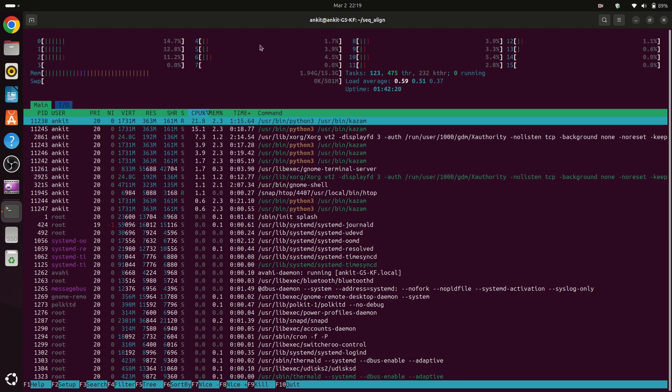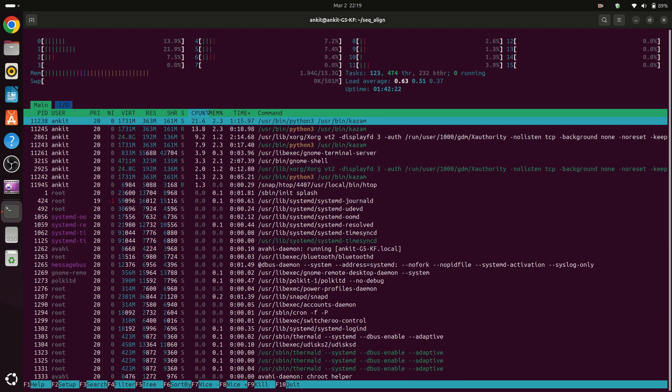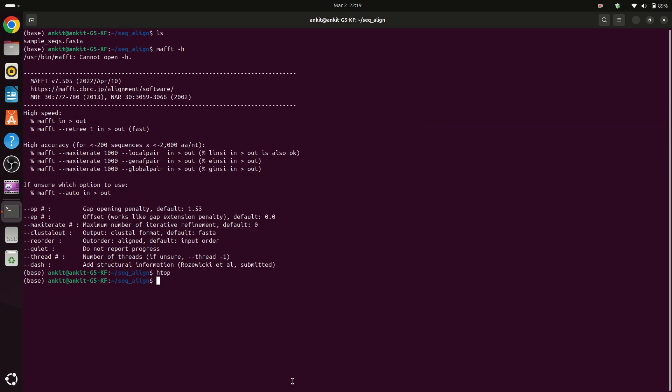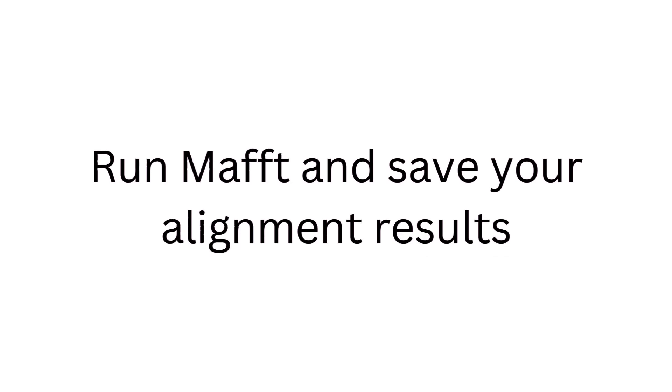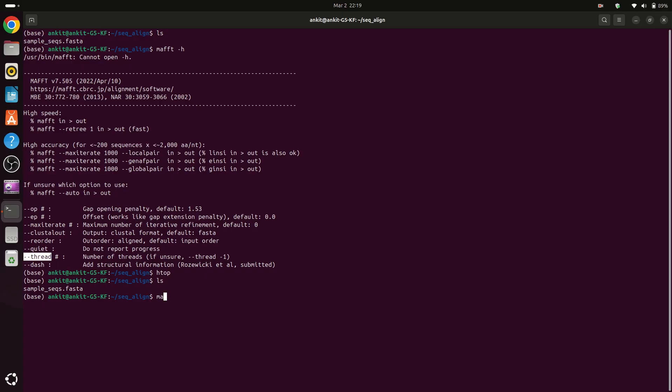So now let's start. First we have to type mafft because we are using MAFFT so we have to call it. Now after mafft we can copy this command and paste here.